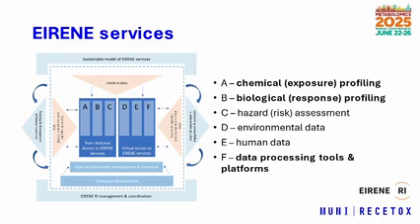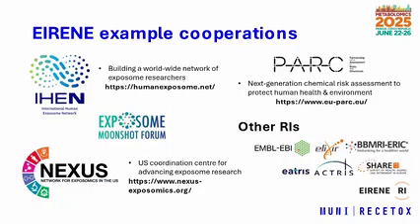This is largely just human population cohorts, because there are other infrastructures which host clinical cohorts, but essentially prospective cohorts that do not have clinical outcomes largely weren't represented, so we have a portion of that. And at the end, because it's highly multidisciplinary, integration, data processing and tools and platforms, a large component comes onto mass spectrometry again.